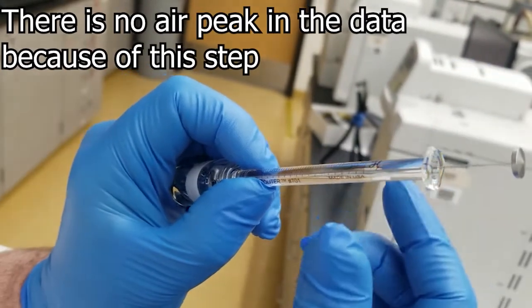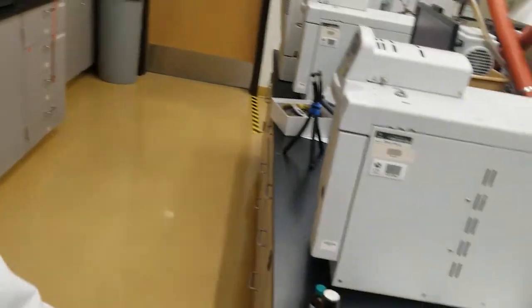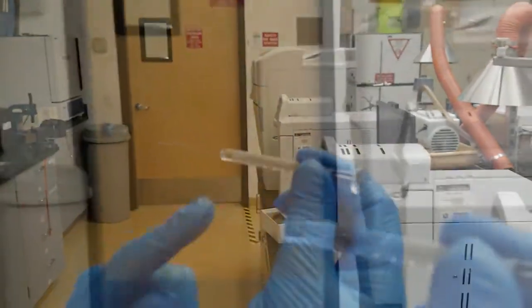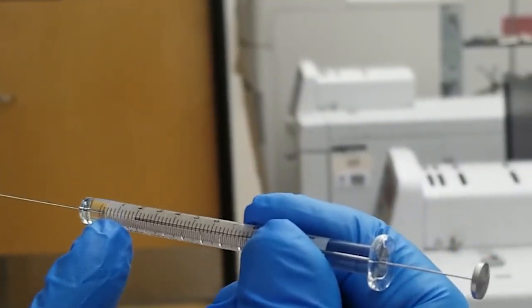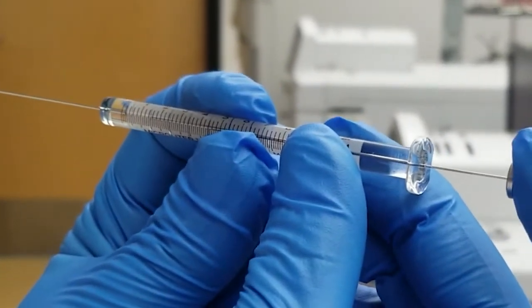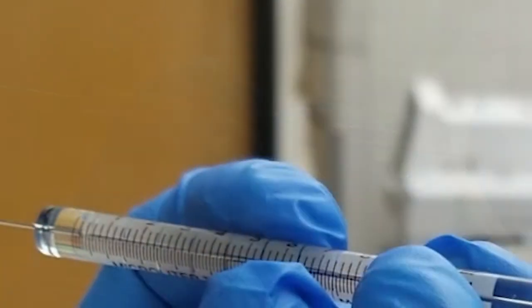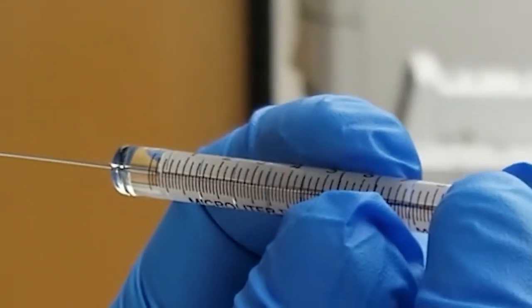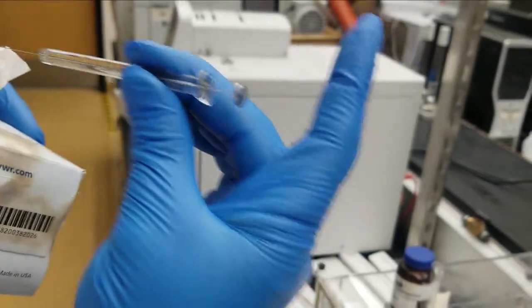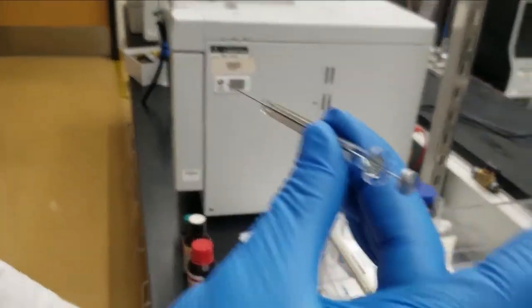So I want to pull in extra, and then I want to bring it down to the level that I want, which I'm going to go to like the first division mark on this syringe. So I'm going to take the plunger all the way down. That's at the second division mark. I'm going to go actually just a little bit more. Then I'm going to want to wipe that tip off to get off any excess that I was just pushing out.